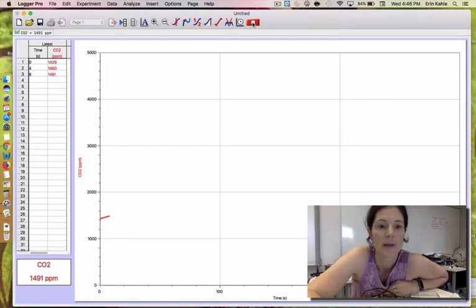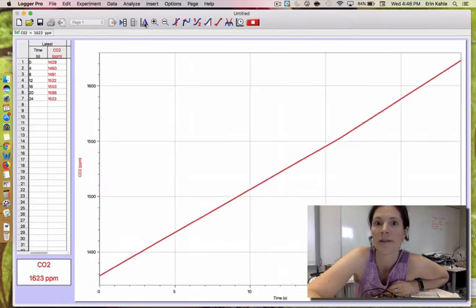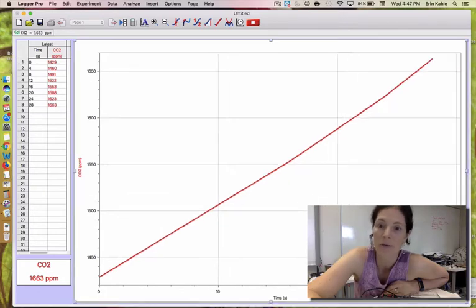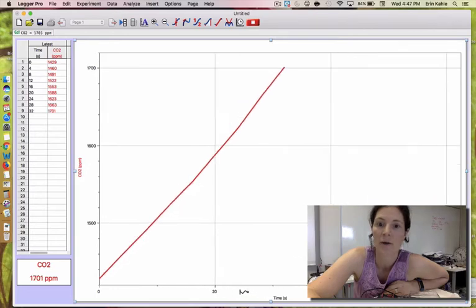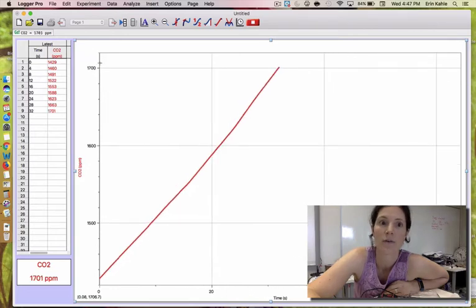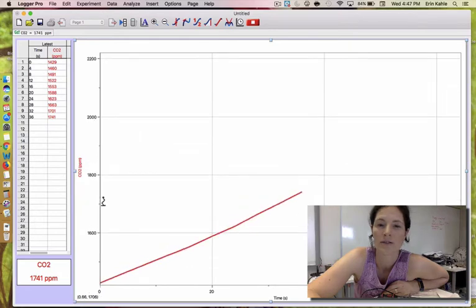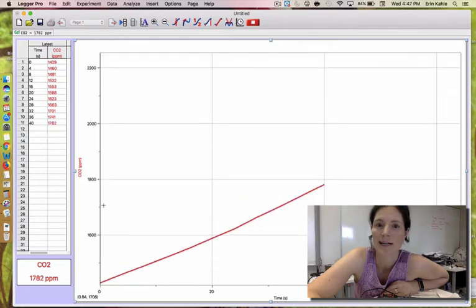As we suspected, the amount of CO2 is going up. But sometimes, especially if you have an O2 probe, it might not look like anything's happening, and you might have to press this A, which will auto scale your graph to something that makes sense. We'd only selected for 20 seconds, but you can also put your cursor here if you want to make that axis different, or pull this one down. It just affects the way your graph looks, not the data.